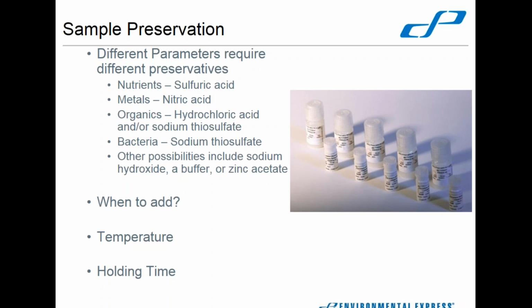And of course, always be aware of holding times. For most of your samples, if you're collecting and getting them back to your facility that day, holding times generally aren't an issue, but it can be for certain parameters such as your bacteria samples. Those do have holding time measured in hours. I think the most current guidance is 8 hours for most of your bacteria.